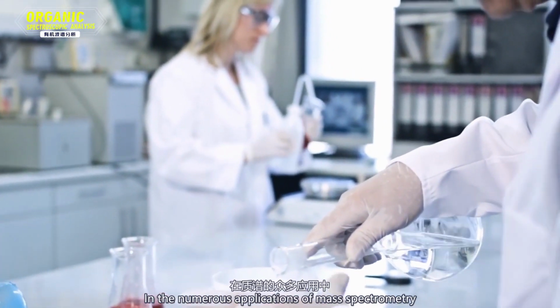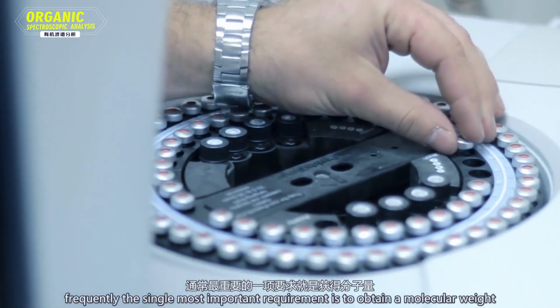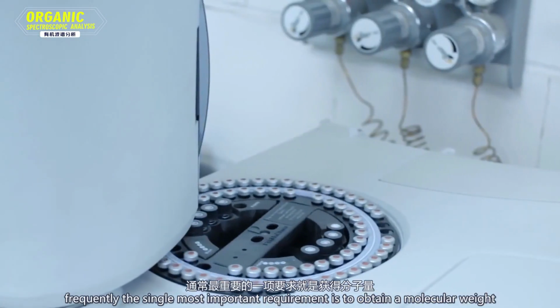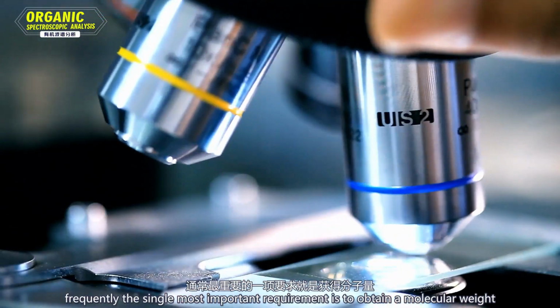In the numerous applications of mass spectrometry, frequently the single most important requirement is to obtain a molecular weight.